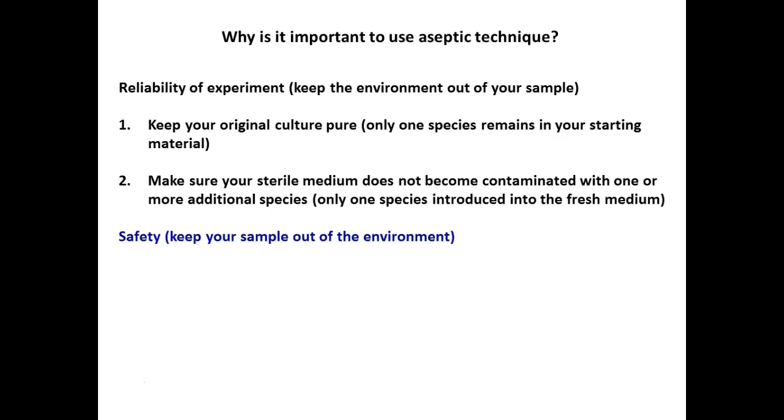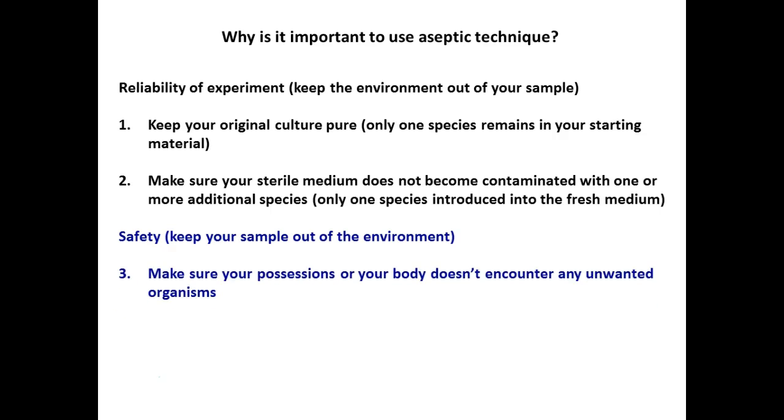Safety, right? We don't want to contaminate our environment. Did we have a spill over there earlier? Is that what happened? Did we spray Lysol? I think I saw you grab the Lysol. Okay. So again, with these cultures, if you spill it, you're spilling microorganisms, right? We need to disinfect when that happens, right? And so we're going to use the Lysol bottles to start and end when we're working, and then if we have a spill, definitely make sure that we add Lysol to it.